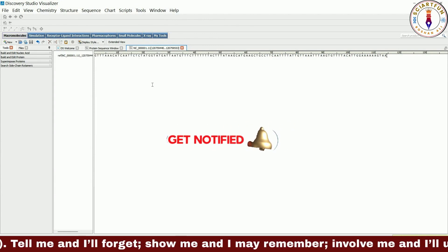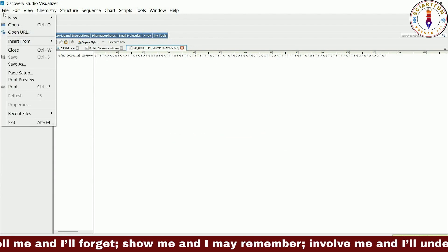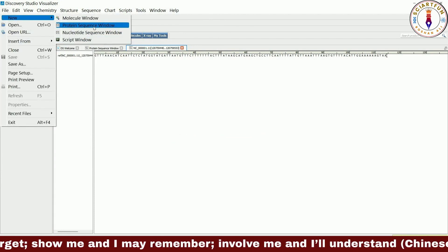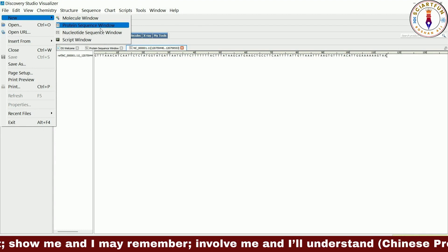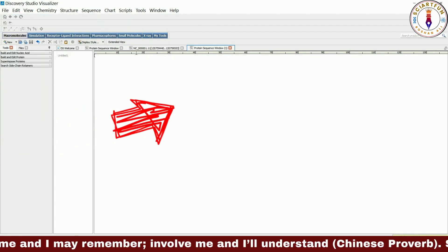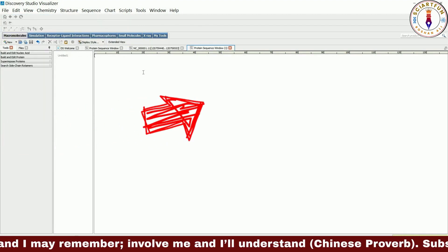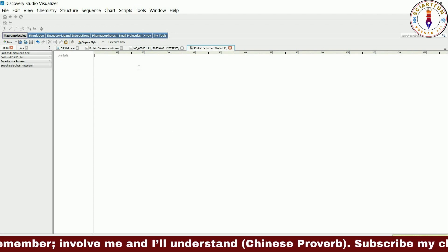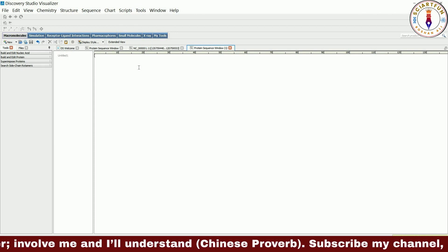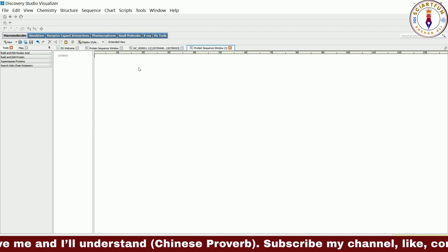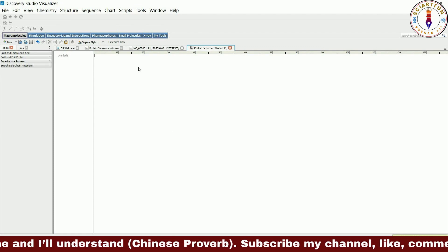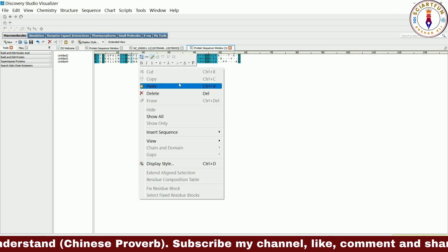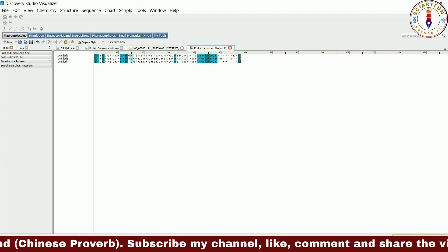In the second method we open a blank protein sequence window from the file menu. Suppose you already have copied a sequence. For example, I have already copied a multiple sequence alignment and now I am going to paste it here.